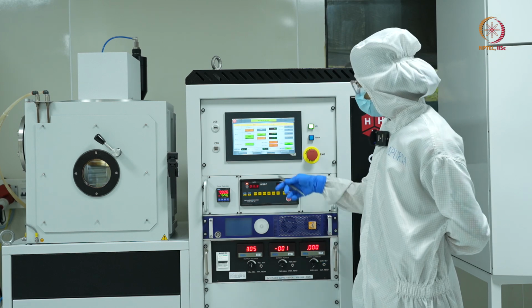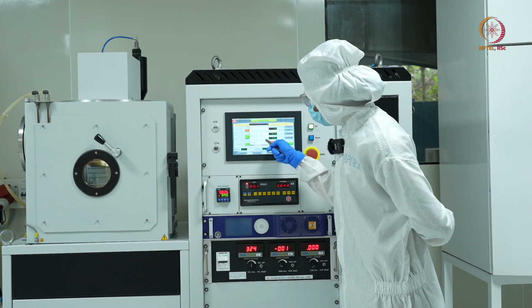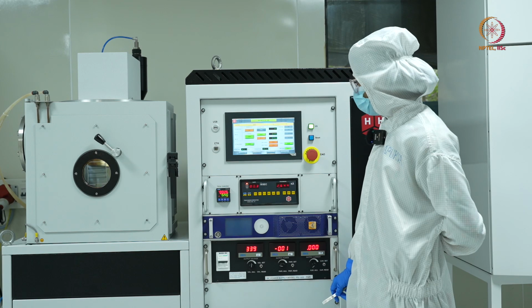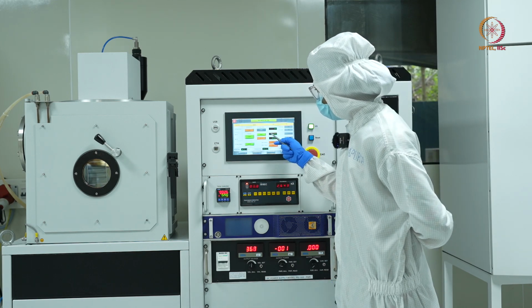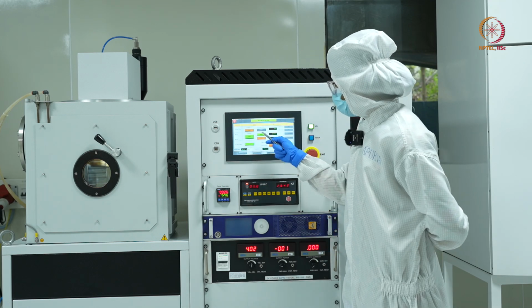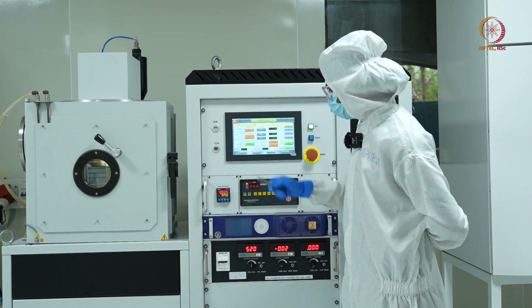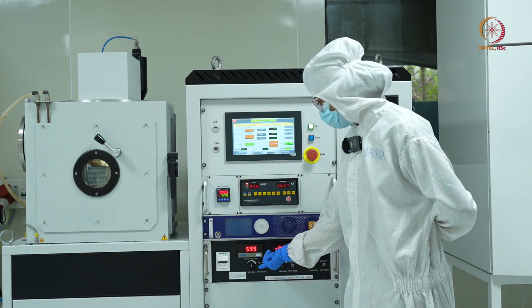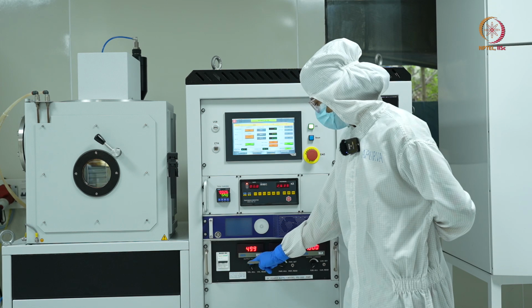Once this is 0, I'll decrease my argon flow to 5, all the way back to 0. And I'll close the gas valve as well. Now I'll move this toggle to set voltage and I'll decrease my voltage all the way back to 0.